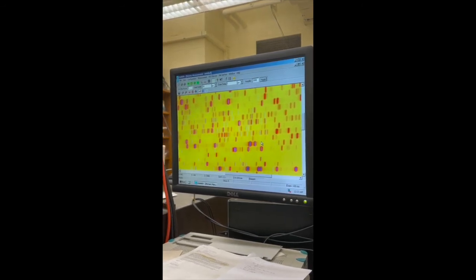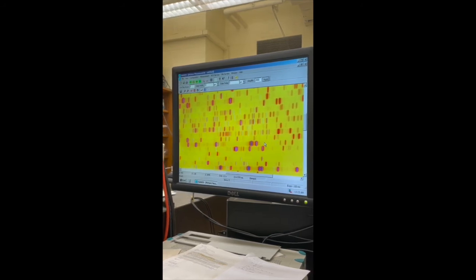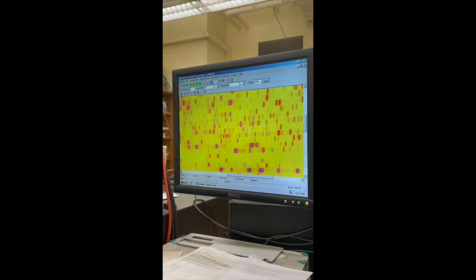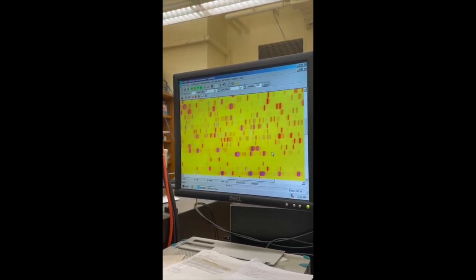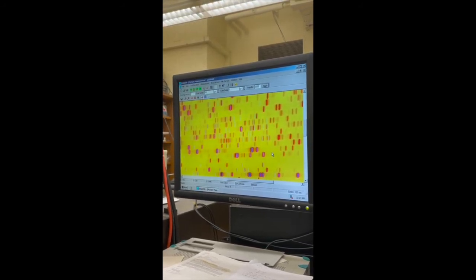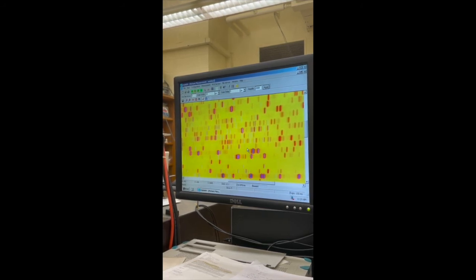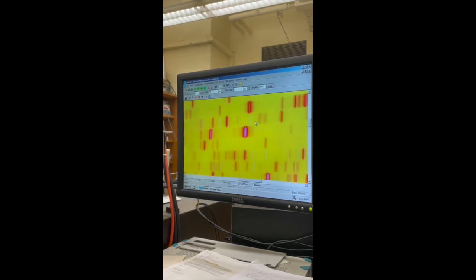So what we're looking for is, do they seem to line up with where they're supposed to be? There's no real scientific way to do this. We just try to look at as many as we can, and you decide for yourself whether you think they're aligned or not. So if you can zoom in a little more on any one of those regions, maybe up at the top, and then work your way down the page, we'll look at these guys.